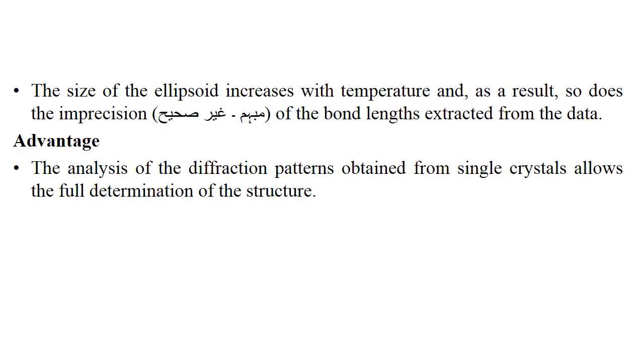Actually, we have discussed that with an increase in temperature, the vibrations or oscillations of the atoms present in a crystal increase. If the vibrations increase, the size of the ellipsoid will increase, and if the ellipsoid size is increased, one would be confused about the lengths of bonds extracted from the data.